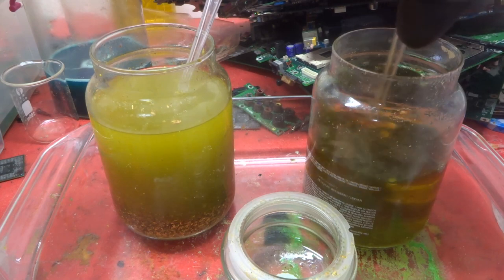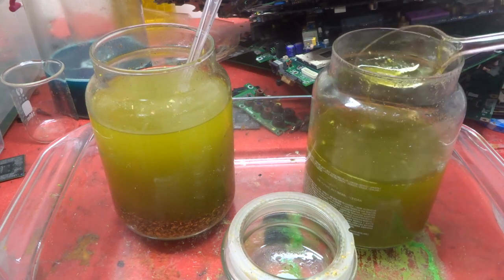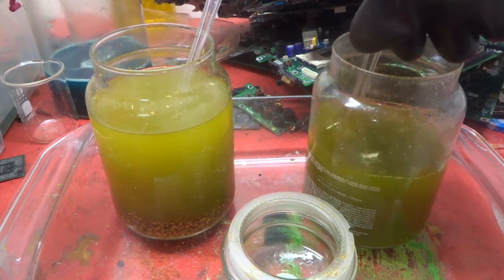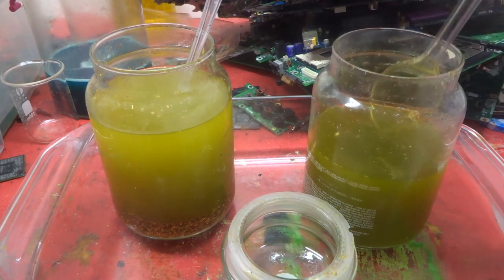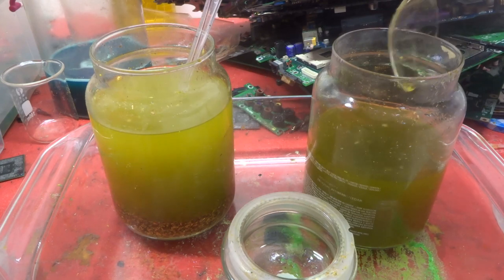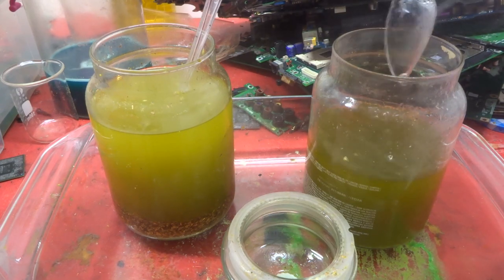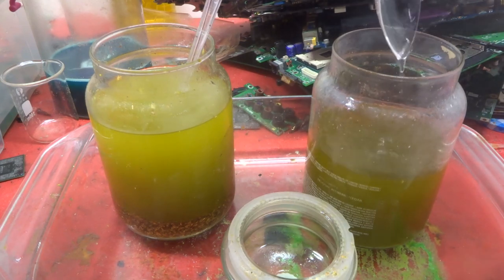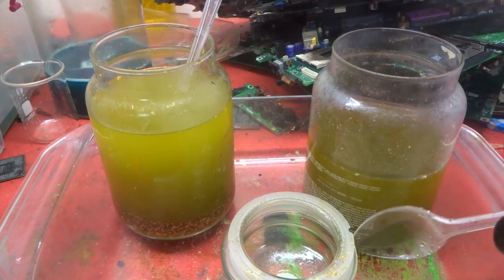You can see the difference where I used nitric on these ones — if I take out some of the solution there are no flakes left at all, just bits of board that may have got in. The actual gold flakes are completely dissolved. The nitric is far, far more efficient. I'll wash down the solution carefully so we don't lose any gold.